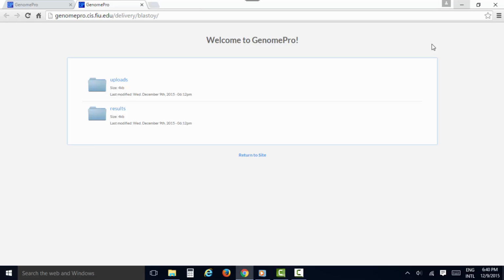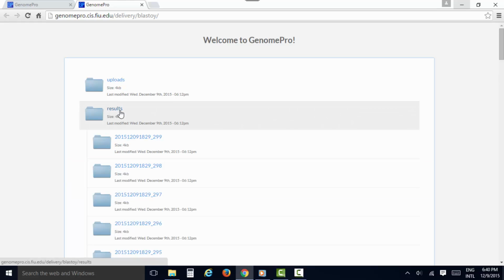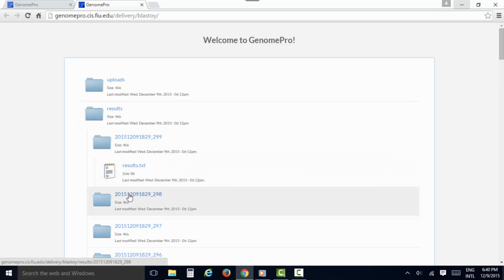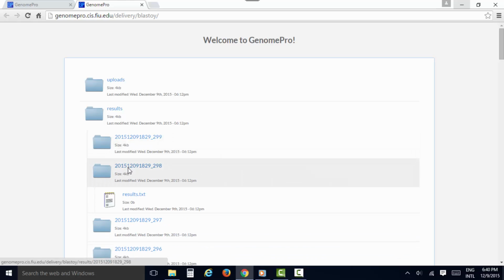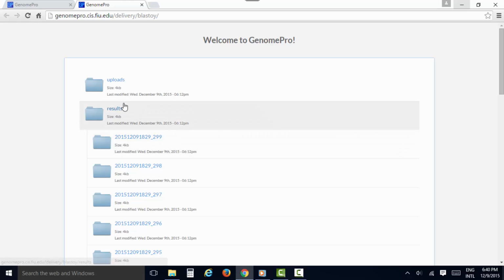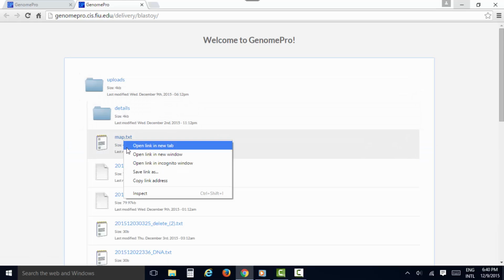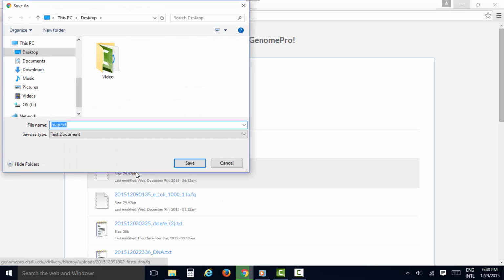This page has all the file information belonging to you, including result files from jobs, uploaded files, and more. It is all split by the latest submission, which makes finding recent jobs and uploads very easy. You can view and download any of this information by right-clicking these files and choosing Save As. Notice that for larger files, it might take some more time than usual.